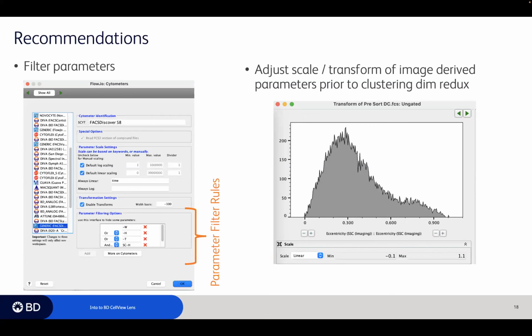So interestingly, it always just shows the top cytometer highlighted when you enter the preferences. It is applying the preferences based on the CYT keywords. So if you open it up, you'll scroll down, pick the cytometer that you're interested in, and that will apply the preferences like that.